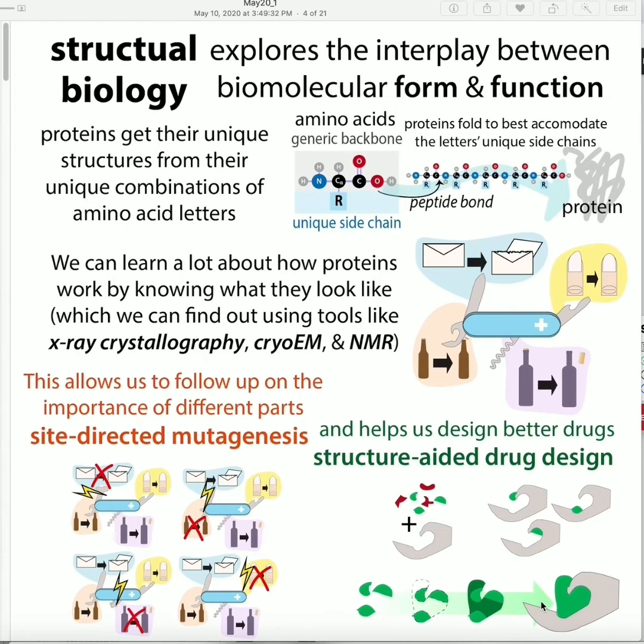When structural biologists use these methods like X-ray crystallography to figure out where the various atoms in a protein or DNA or other molecule are located, we say that they're solving the structure. By atoms, I just mean those individual carbons, oxygens, hydrogens, nitrogens, etc. These scientists solve these structures, and then they deposit them in a database for everyone to see.